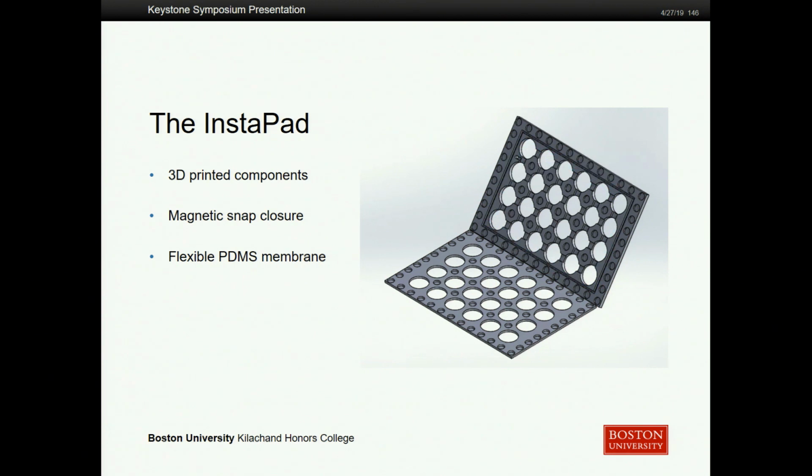And then there's a ridge along the outside so that we can glue down the PDMS membrane to actually achieve the inflation. And then of course, we have glass on the top and bottom so we can allow light to get through and whatnot.